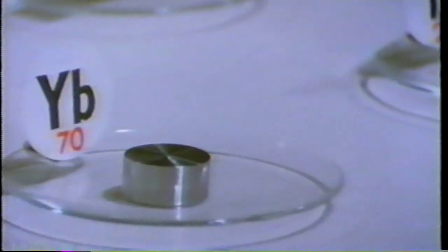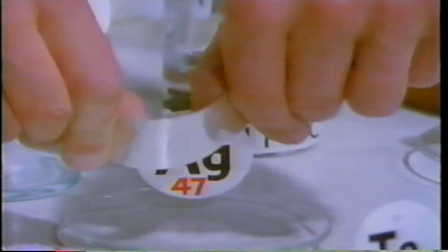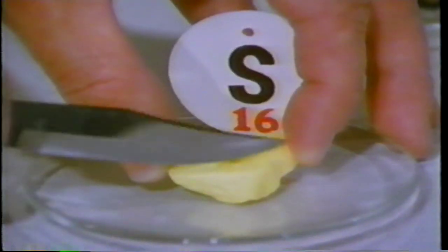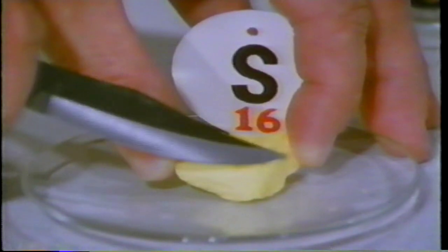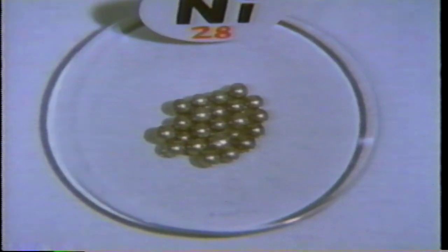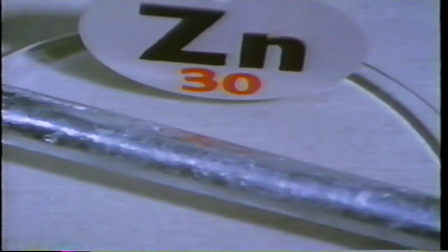Shininess indicates that the element is a metal. Many metals, such as silver, are ductile. That is, they can be bent without breaking and, like potassium, be cut smoothly. For contrast, sulfur lacks the shine we associate with metals, nor is sulfur ductile. Such elements are called nonmetals. Let's sort the metals from the nonmetals, first using shininess as a criterion. Here are metallic copper, chromium, zinc, samarium.